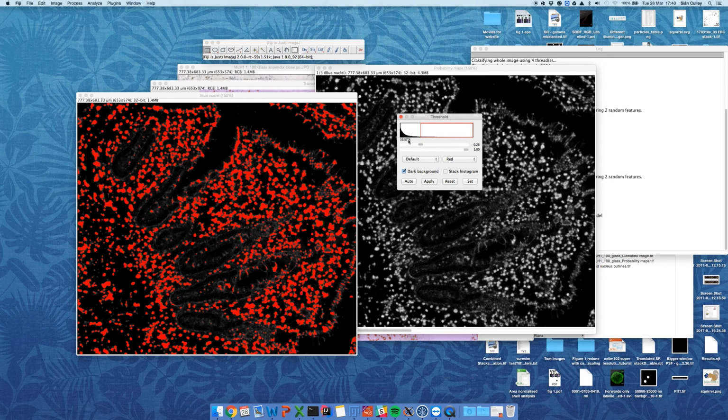So at the moment we're keeping 16.5% of our image. Oh dear, I've got in a muddle here. Let's start that again. So here we're keeping 16.57% of the pixels, so those are the ones that are shaded red, and we're getting rid of all of these ones. So we've got dark background text because that's our baseline. So what we can do is, as we move this, we see we get less and less red, which corresponds to that percentage there.